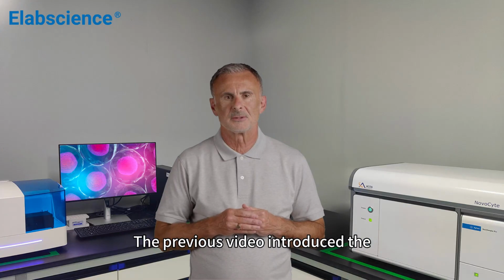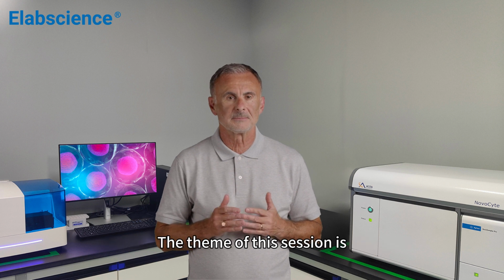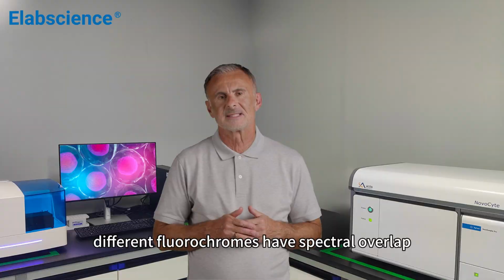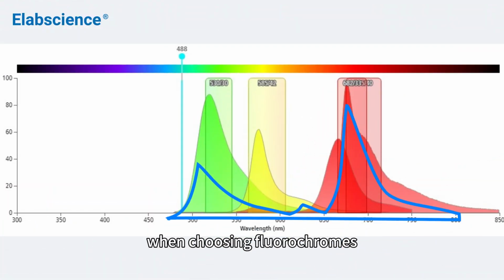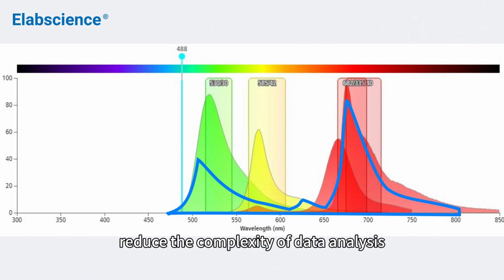The previous video introduced the basic knowledge of fluorescence and antigens. The theme of this session is multicolor panel design. First, different fluorochromes have spectral overlap. Therefore, when choosing fluorochromes, try to use combinations with minimal spectral overlap to reduce the complexity of data analysis.